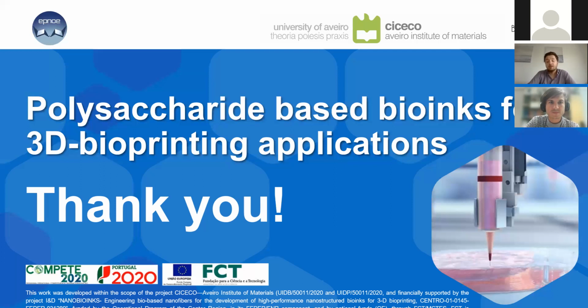If you use alginate, for example, we can chelate the calcium ions using EDTA and create, as Professor João showed in one of his slides, a kind of liquefied center. So what I want to say is there is the possibility of using these templates and removing them selectively after. For example, I know that silica templates can be removed selectively in the end. But I still haven't done it. I've just started and I still haven't explored much.